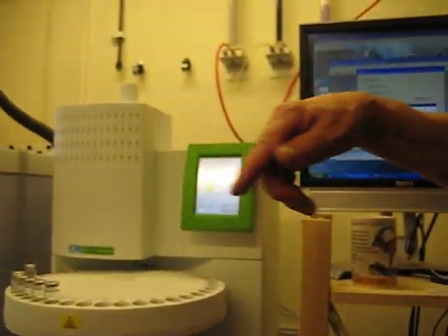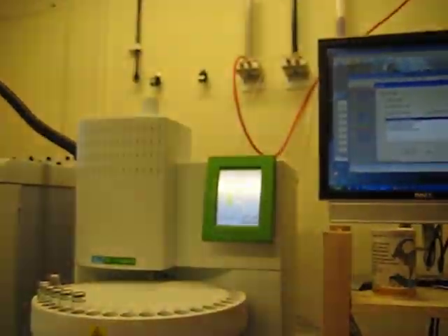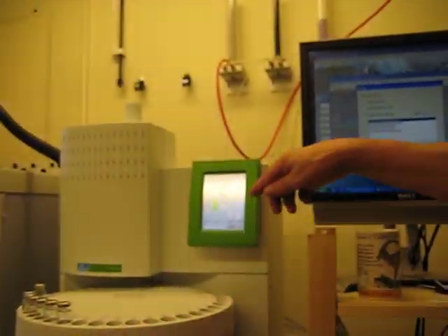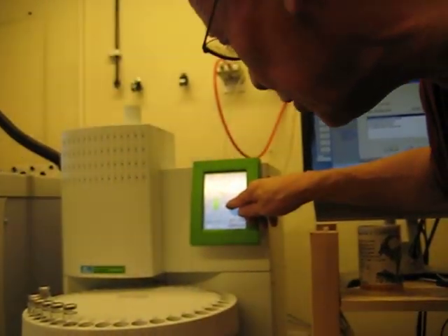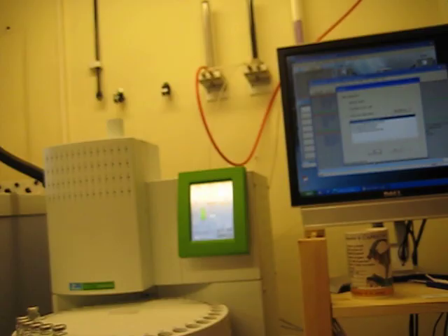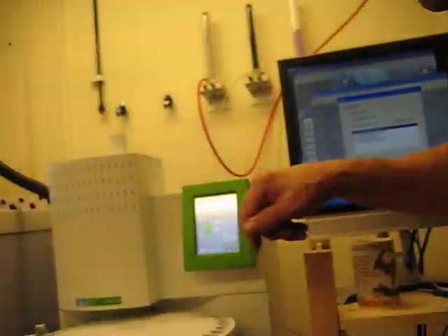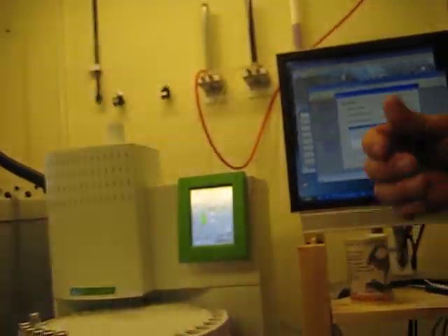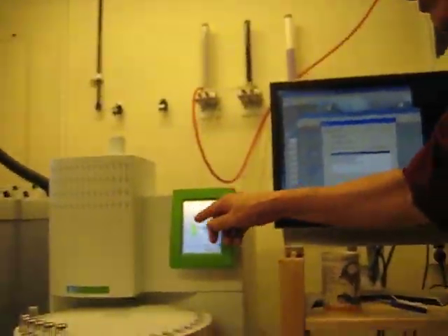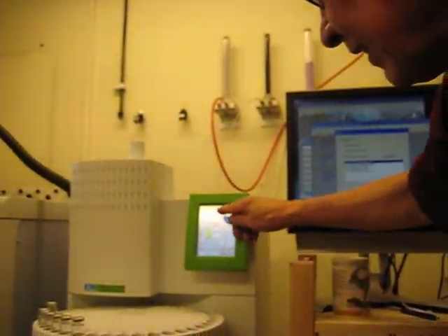Track oven, that is for very, very lazy people who don't want to have to choose 3 temperatures. Then it will automatically choose 65, in fact. But I really don't understand that. That's for very lazy people, I think.